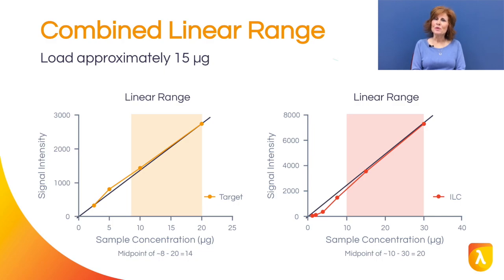In this example, the tangency continues in a straight line past the 20 microgram and 30 microgram ranges plotted, respectively, in both graphs. In theory, you could then widen the linear range by extrapolation. However, extrapolation is not a reflection of or a replacement for real data.